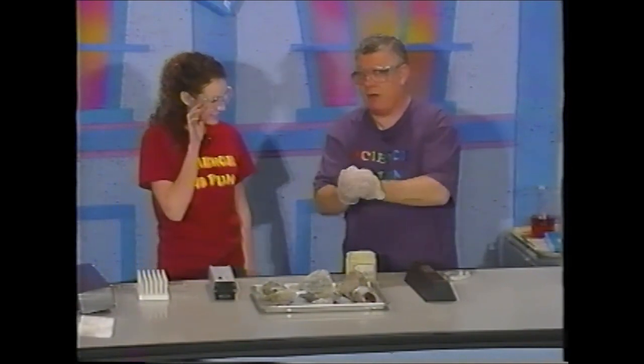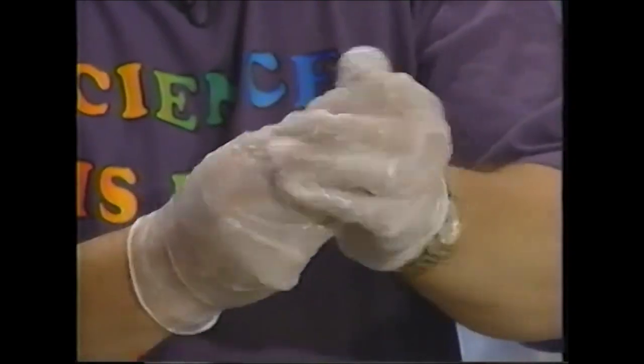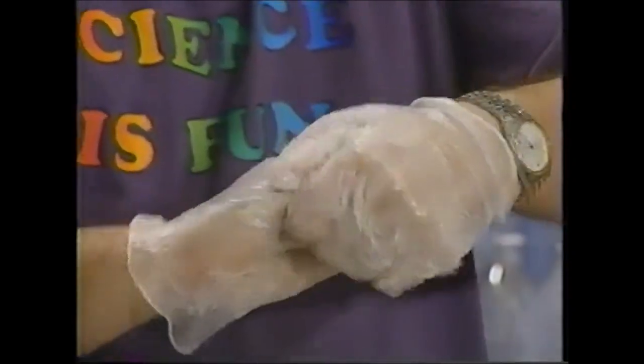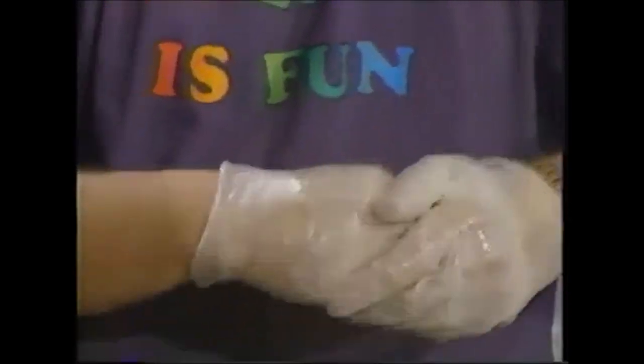Yeah, they do, yeah. But I want you to now look at my gloves with the lights down using the long wave ultraviolet lamp, the black light. So could you do that? Okay. Just get that can out of the way right there, yeah? Just put it on the side. And now, can you see my gloves now? And I put some on the tabletop here, so that's glowing too.